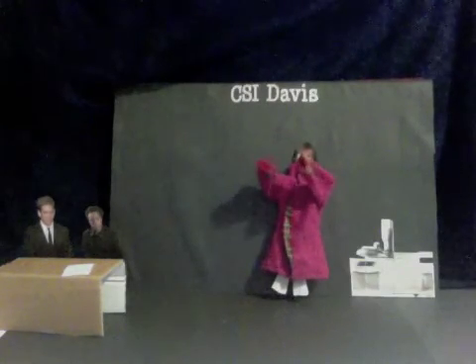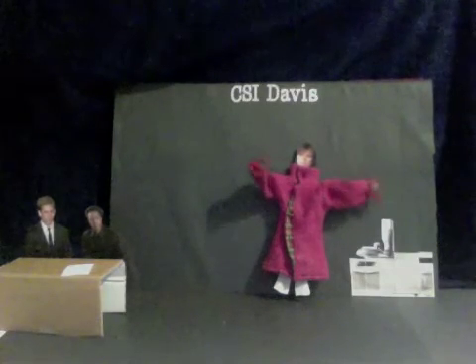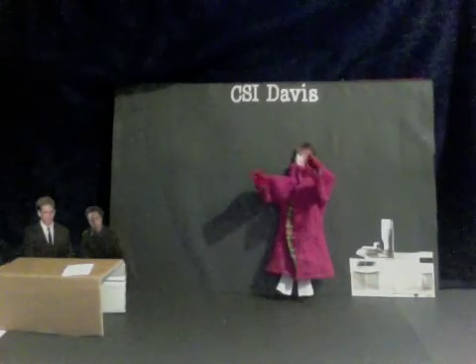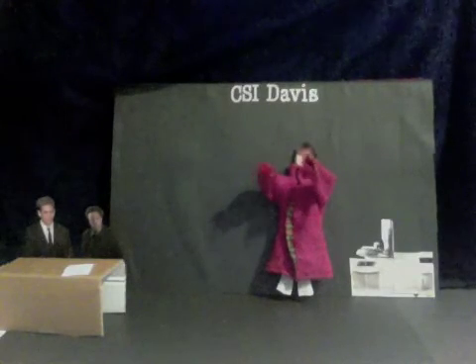Finally, these ions will go into the detector. There's the detector. You can see them going. This way, we get the output, which is called a mass spectrum. The mass spectrum is a series of peaks, and the peaks give the mass of all the components.